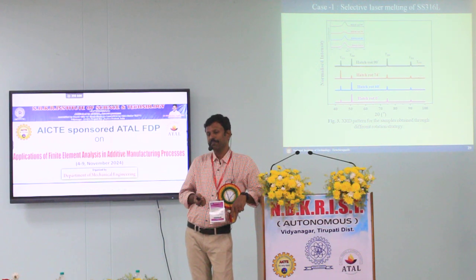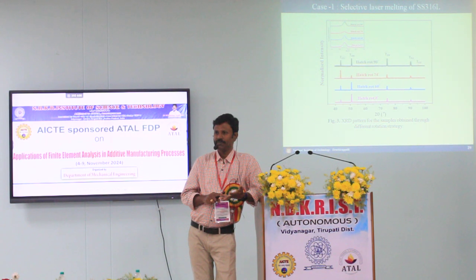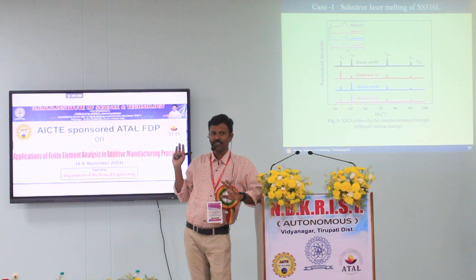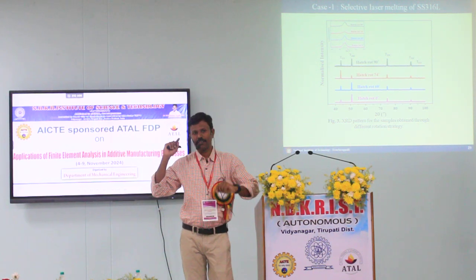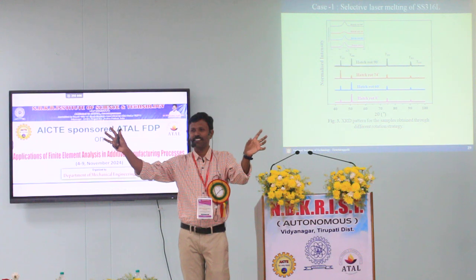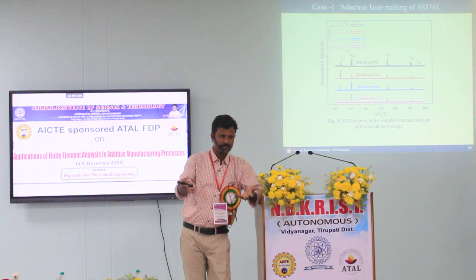But from XRD, what all information can we get? From XRD, we can get complete crystallographic information. On XRD data, if you apply Rietveld analysis or a statistical analysis method like this, you can see atomic positions in the unit cell. Probably in material science you might have studied the cubic system: 8 corner atoms. Normally I will show the room, all 8 corners have 8 atoms. Center one, a hanging ball, BCC. Every wall center, FCC.